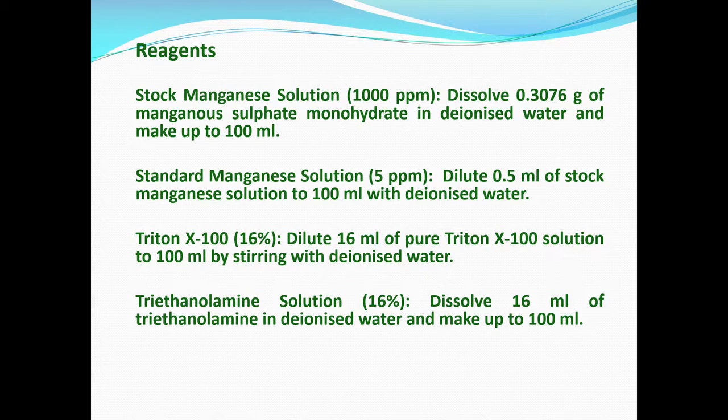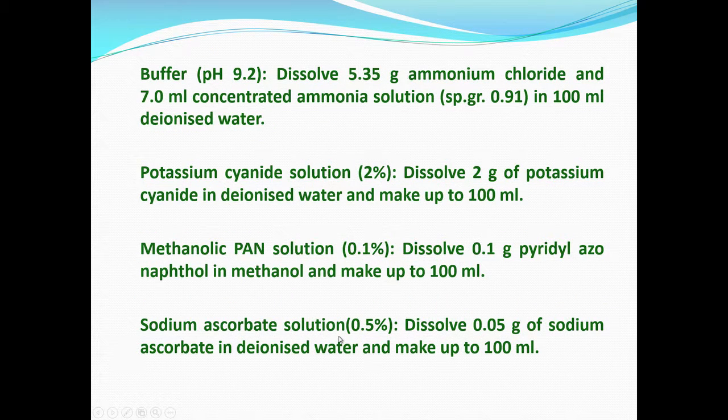And triethanolamine is not so viscous as Triton X100, but we can prepare 16 ml of that triethanolamine in deionized water and use it as a complexing agent.